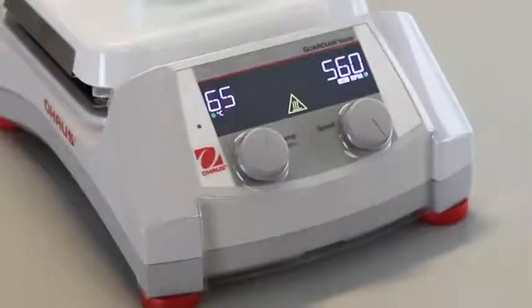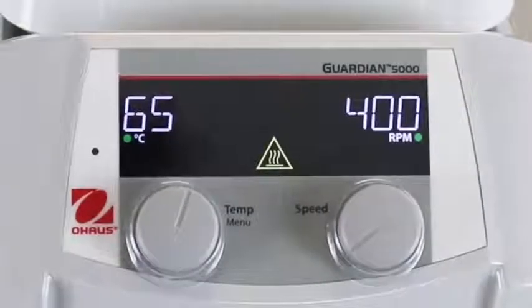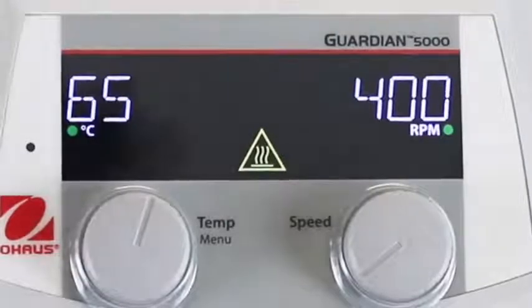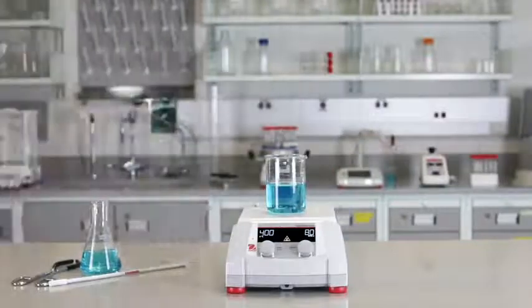The Guardian 5000 series features an easy-to-read bright LCD display with large temperature and speed settings, intuitive icons, and a prominent hot top light designed to ensure you can monitor unit performance from across the lab when the heater is above 40 degrees Celsius.